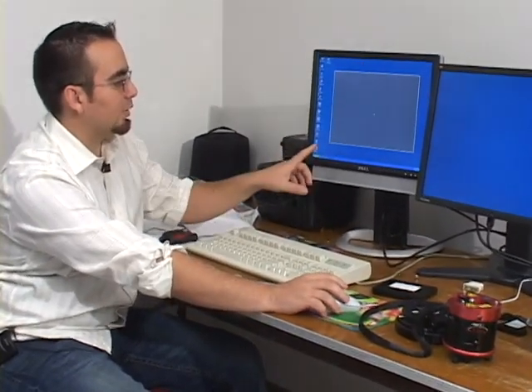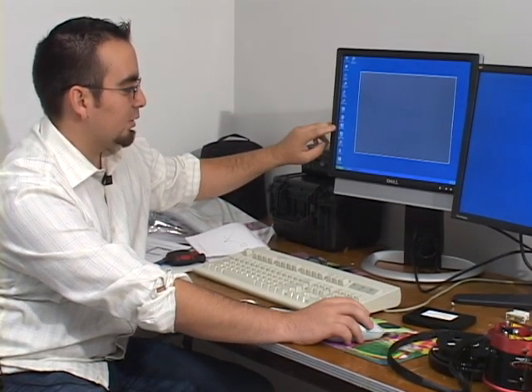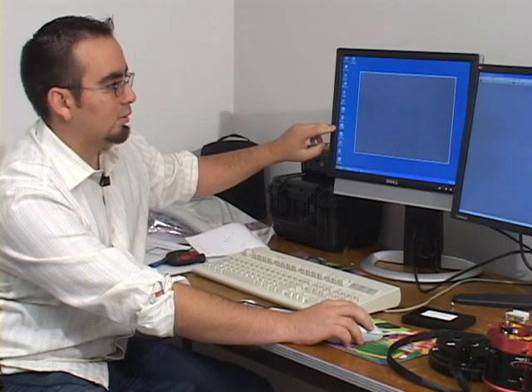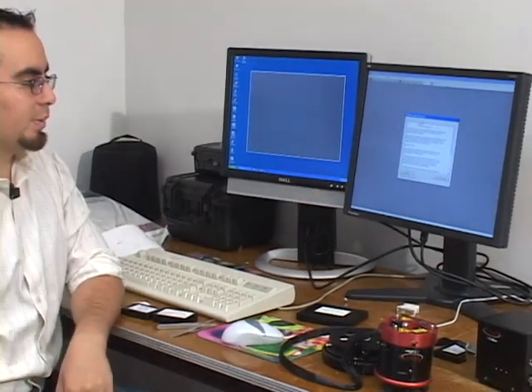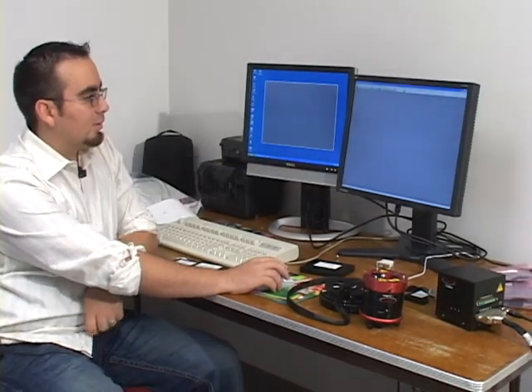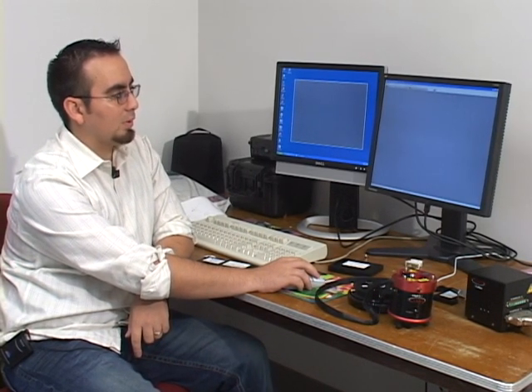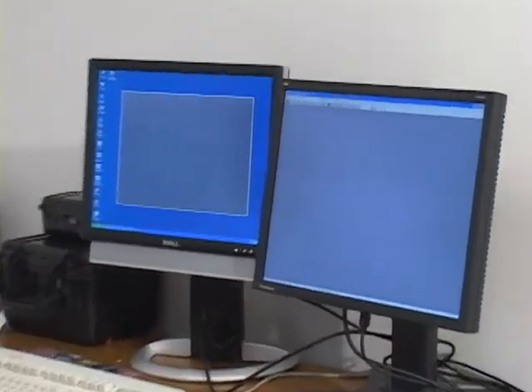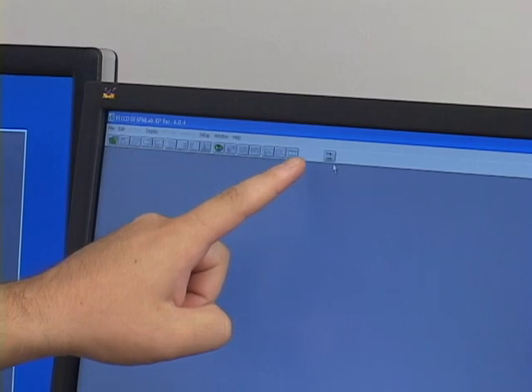After you have the video on, now you can turn on the software, SPM Lab 604, which is right here. So double click that, and then the software will appear on the right screen. Of course, click accept. After you accept, you get a blank window. And there's an icon with like the cross section of a probe and a sample. Click on that to go into real-time mode. So we click this one here. Click on the real-time icon, which is the cross-section of a probe and the sample.